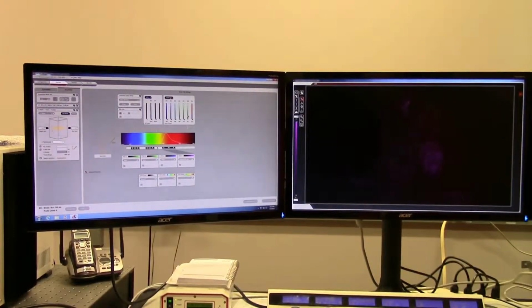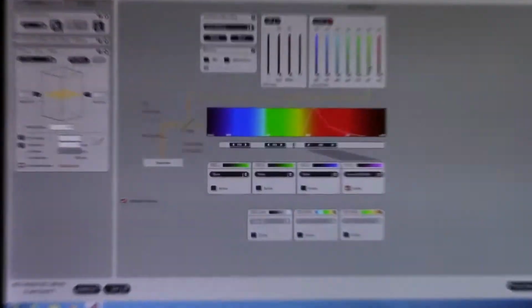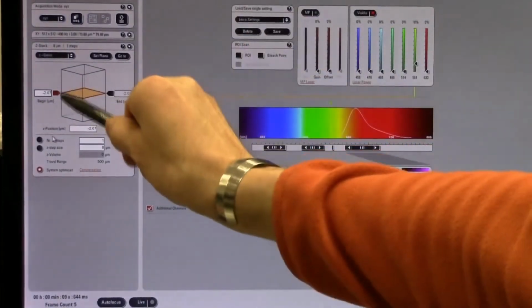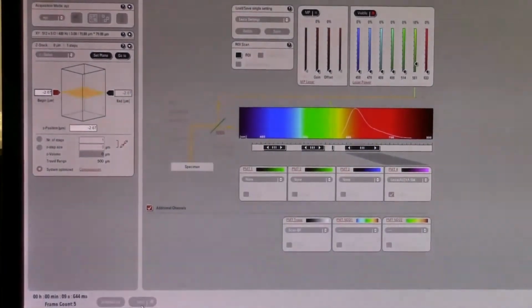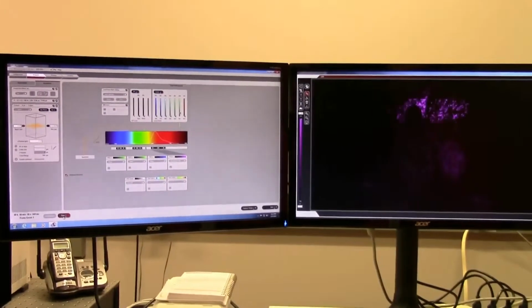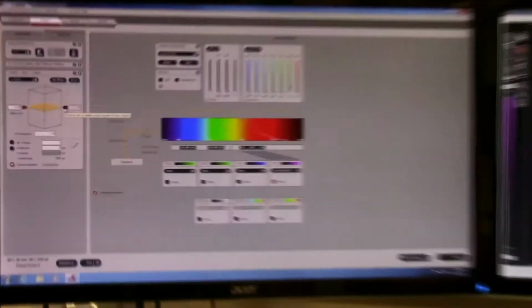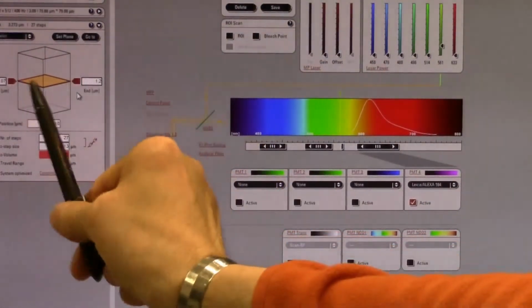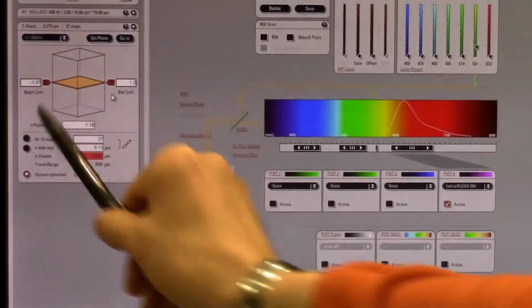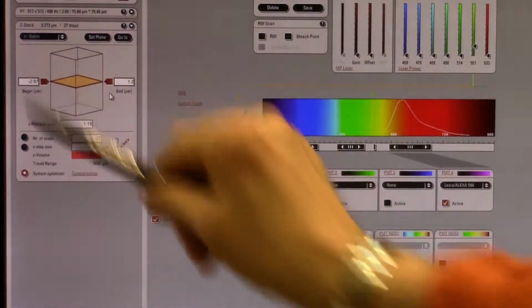I'm going to press stop, and we're going to press this arrow, which is going to then lock the top position. And what should happen is the arrow should turn red. We're then going to hit the live button again and focus our Z position through the object, through the middle of it, into the back of the object. Press stop, and once again click the arrow and it will turn red. So if your volume is properly set, you should see 2 red arrows. You should see your beginning point and your ending point, and they should be hopefully very different numbers.